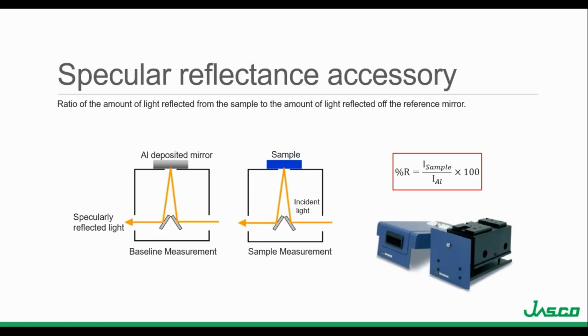To measure the relative specular reflectance of a shiny or mirror-like sample, an aluminum mirror is used as a reference standard. So all relative reflectance measurements, specular, diffuse, and total, assume that the standard surface being used has 100% reflectance. So it's therefore important that the reference plates are kept clean and in good condition so their reflectance characteristics remain constant and don't lead to incorrect reflectance values.